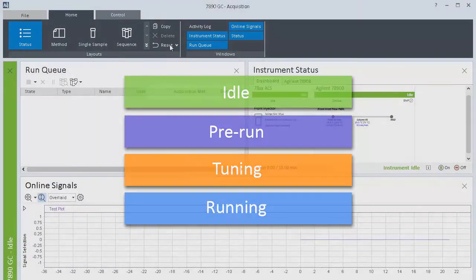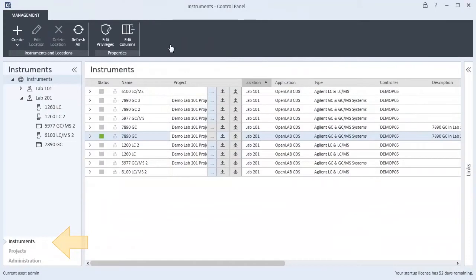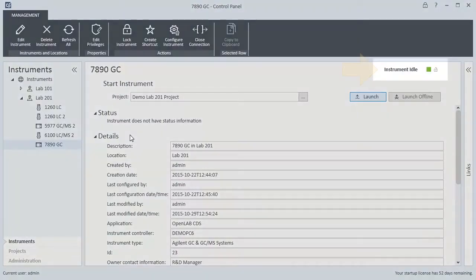Instrument Status can also be viewed from Control Panel, in the Status column of the Instruments table, and at the upper right corner of the Instrument Details view.